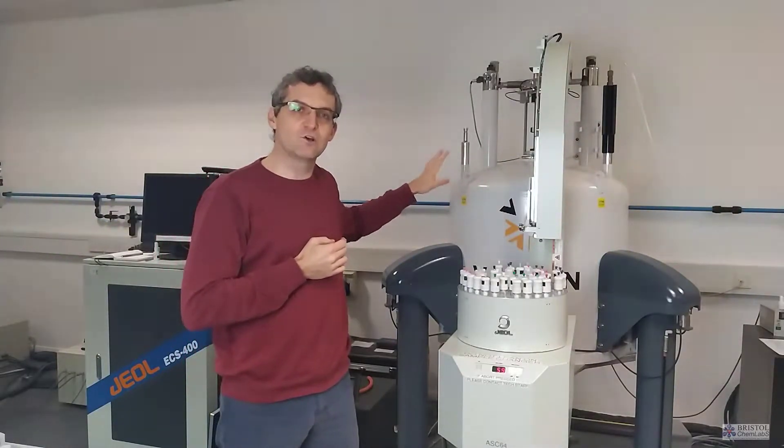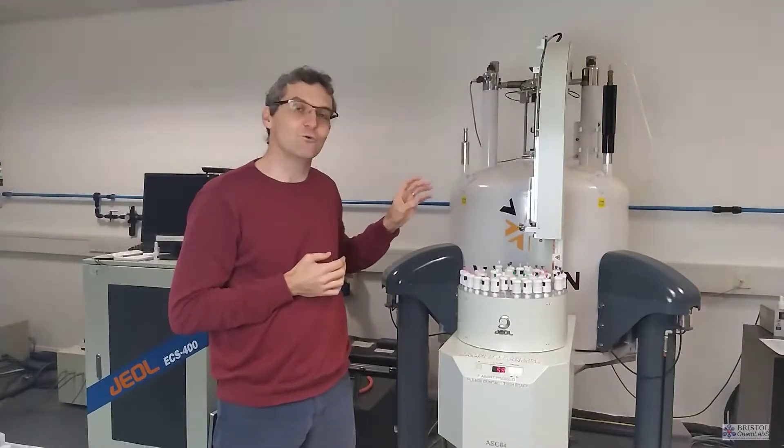Inside this can, the wires are being cooled, they're bathed in liquid helium, which has a temperature of around about two Kelvin. So that's two degrees above absolute zero. On the Celsius scale, that's around about minus 271 degrees Celsius. So that's incredibly cold.